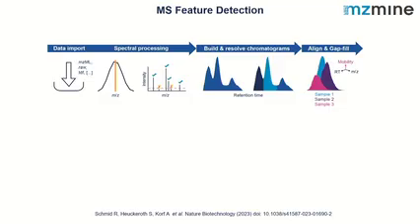We try to find the same m/zs across the whole retention time range and create extracted ion chromatograms. And then we try to separate those into features. And a feature, because we're doing mass spec, is basically an ion, hopefully, or maybe noise, right? But it's an m/z that's defining the feature, and then we have some additional metadata like the retention time, peak shape, maybe CCS, ion mobility, and all other properties that we measure.